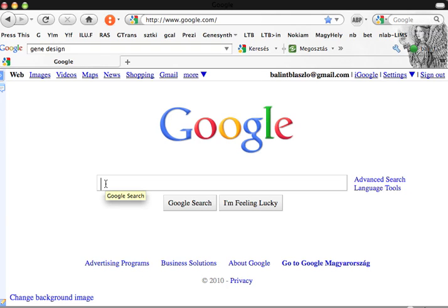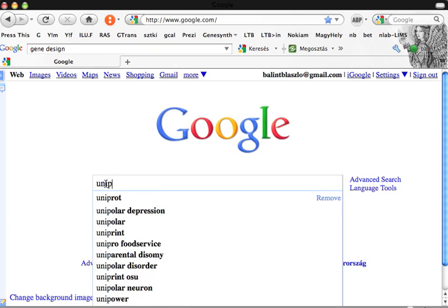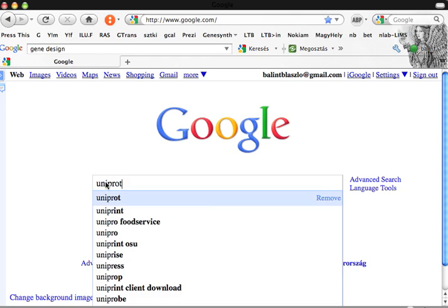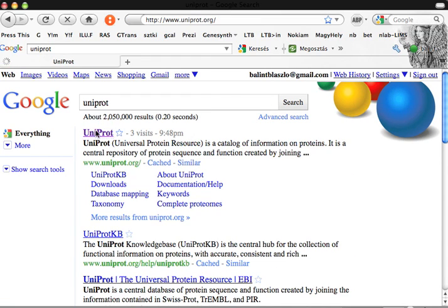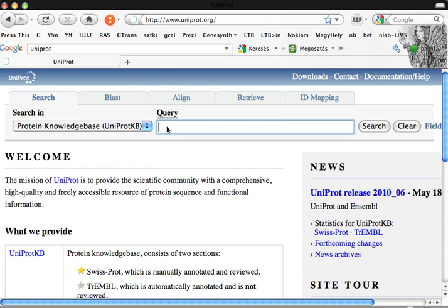The database we will use is Uniprot. Go to Uniprot and write here your gene of interest, for example PPAR Gamma.